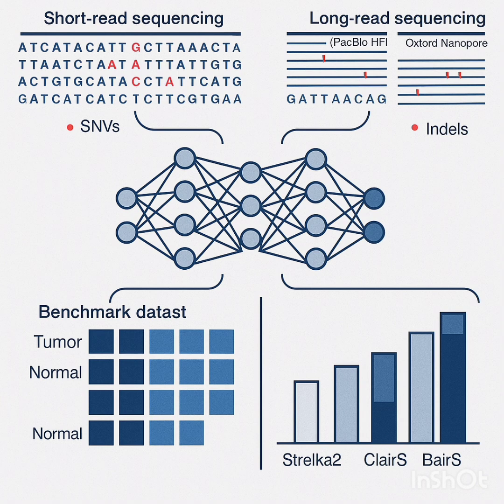Okay, so here's the final thought I want to leave you, our listeners, with, drawing from the research itself. Even after generating this massive new data set, this huge leap forward, the researchers themselves noted they are likely, and I'm quoting loosely here, quite far from reaching diminishing returns on training data. That's such an important point. It's humbling, yeah, really. It tells us that cancer is just so incredibly diverse. The mutational signatures vary wildly, not just between cancer types, but between individuals, even within a single tumor. So even this massive data dump is just scratching the surface.